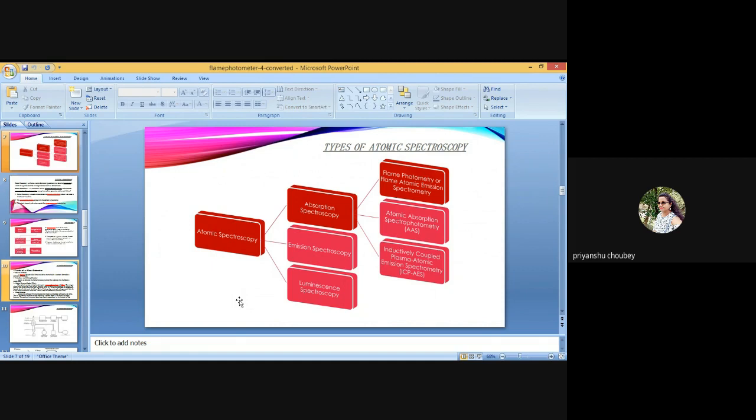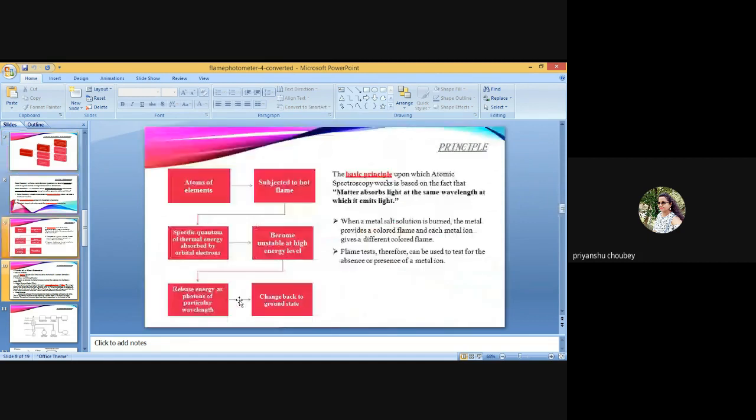A calibration scheme was devised for 30 elements that satisfies the needs of analysts engaged in soil, water, tissue, and particulate matter analysis. Operation of ICP-AES: the general principle for the operation of ICP is similar to that for AAS.